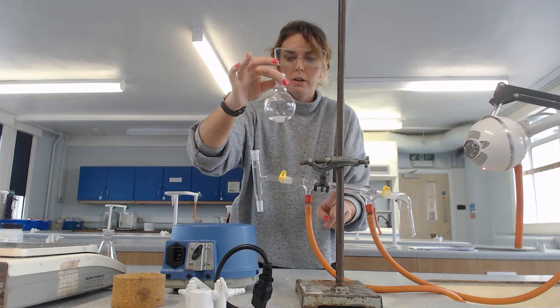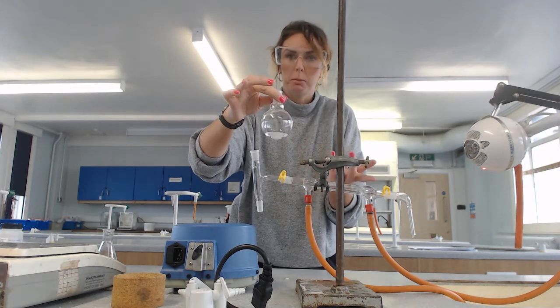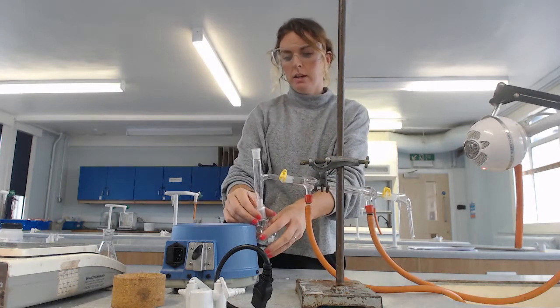Distillation separates products based on their boiling point and condensation point. I've got my antibumping granules in there and I can then put that in place.